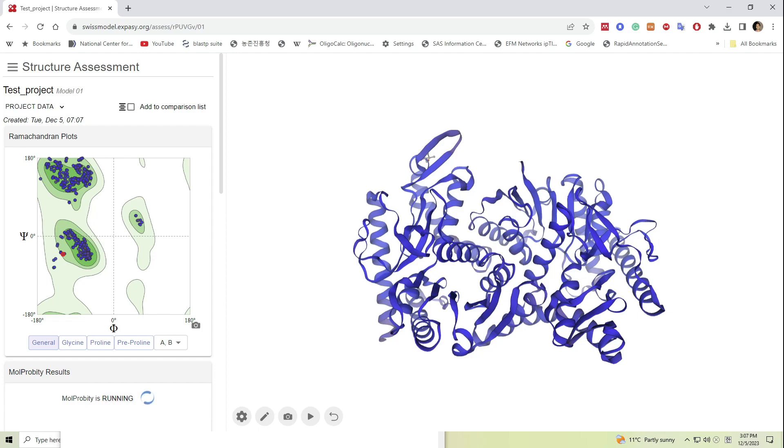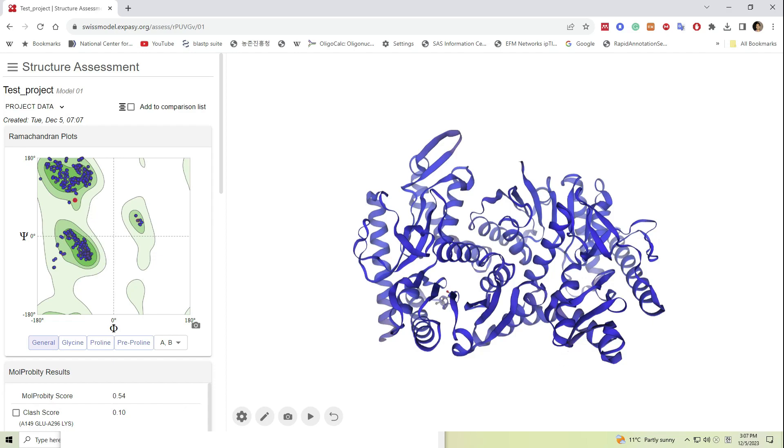Since the graph is interactive itself, it is easy to identify the residues in the three-dimensional space.